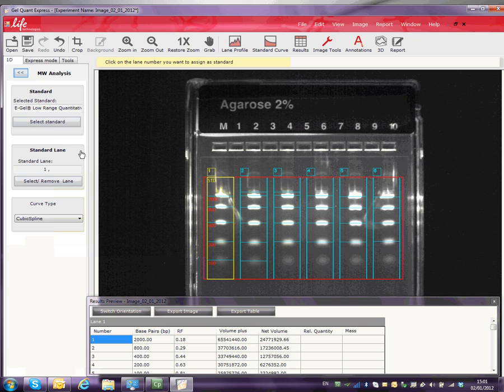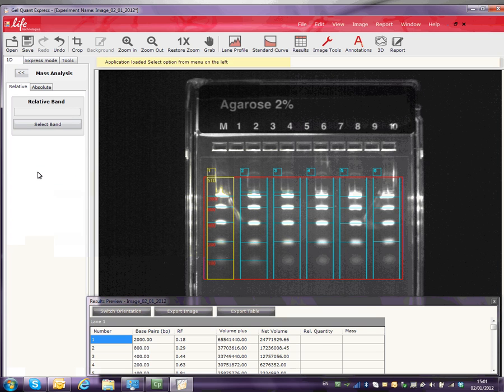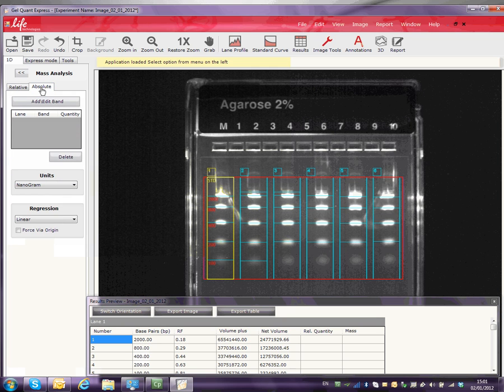Click on the double arrow to go back to the main menu. Select the Mass Tools button. We used a mass marker for this gel. We have selected the Absolute tab.